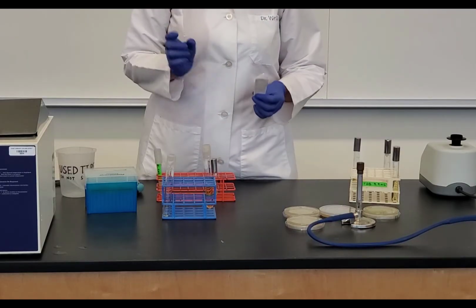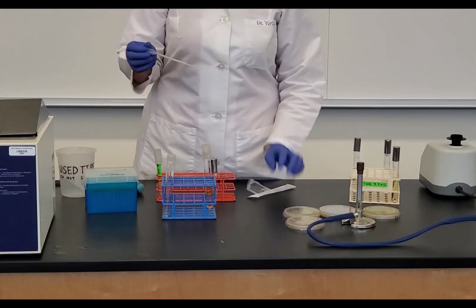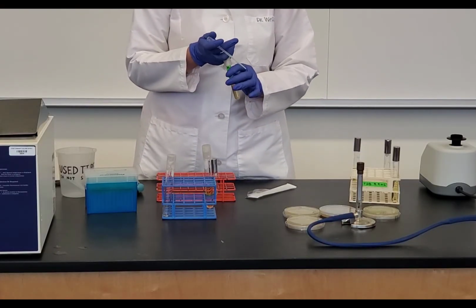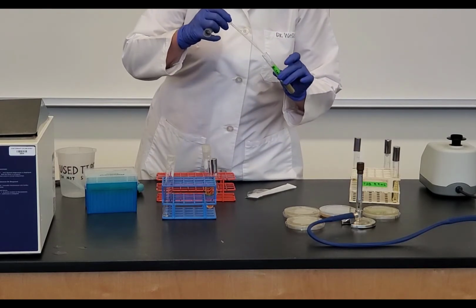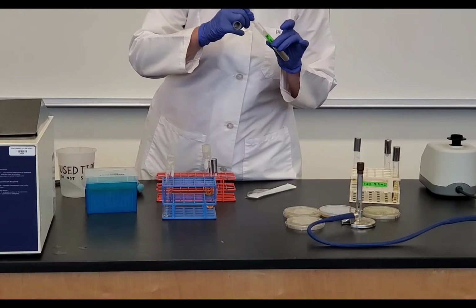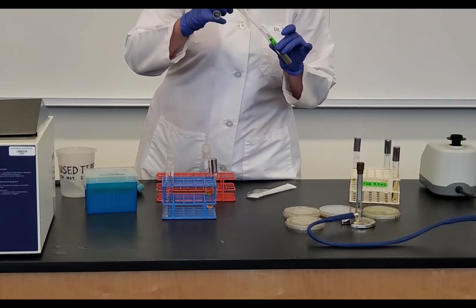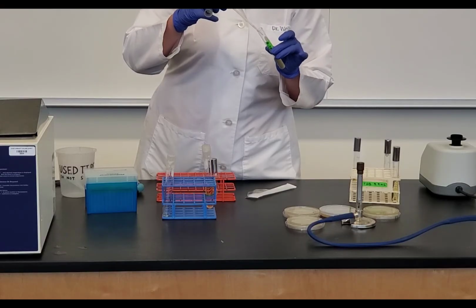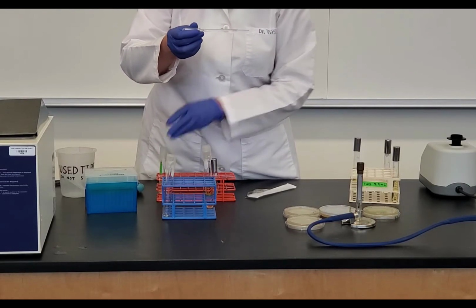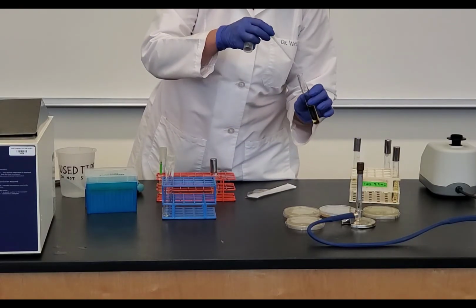I need to transfer my E. coli, so I'm going to use my transfer pipette again, and I'm going to pull it out. And again, I'm going to vortex to mix. I'm going to flame the opening, and I need 0.5. Okay, and then once I have that measured, I can let it go up in the pipette. It's not going to hurt it. Flame it, cap, add it to my melted agar deep. Flame it.